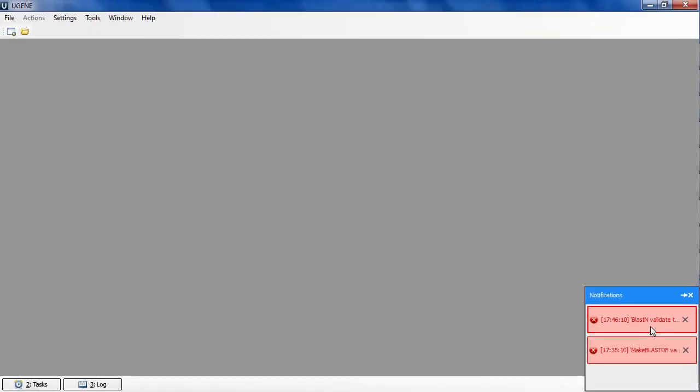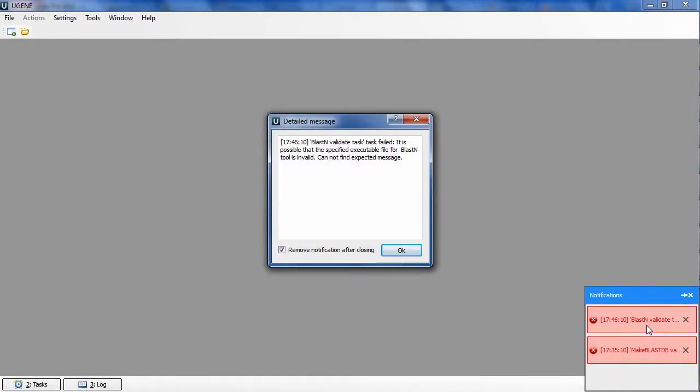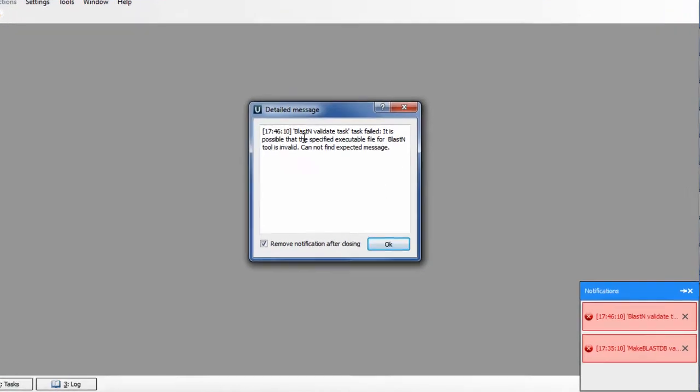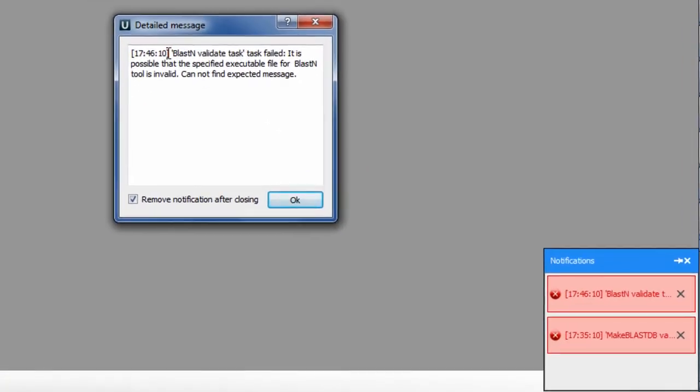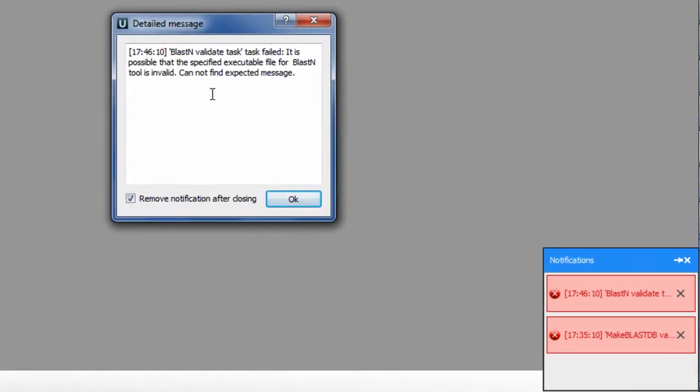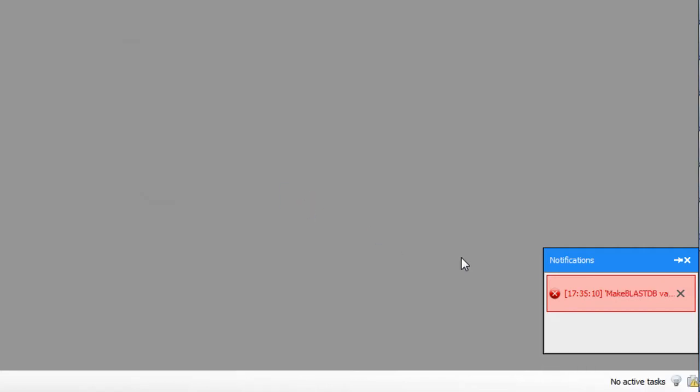By clicking on this message, I can see its detailed description. It says that the specified executable file was invalid. By keeping Remove this notification after closing checkbox checked, I remove this message from the notifications list. This is the new notification system, which we hope will make UGENE experience simpler and more efficient.